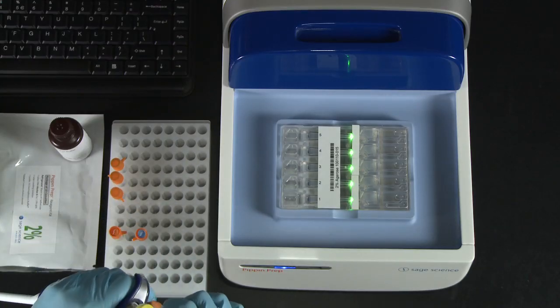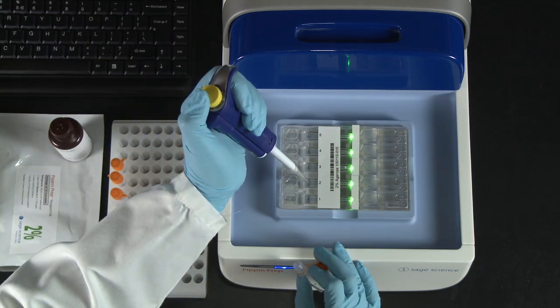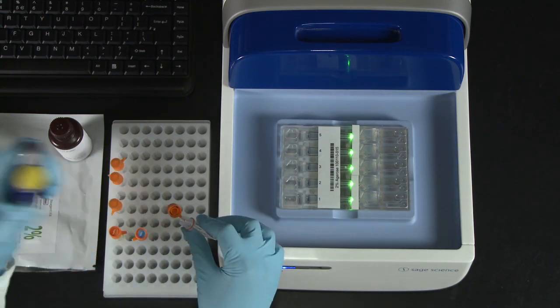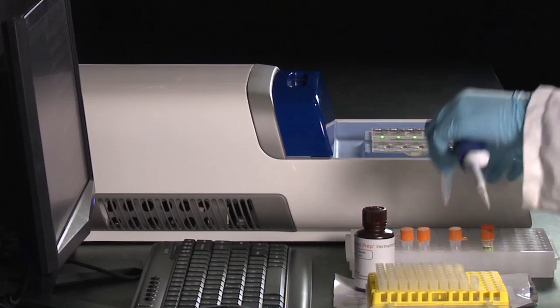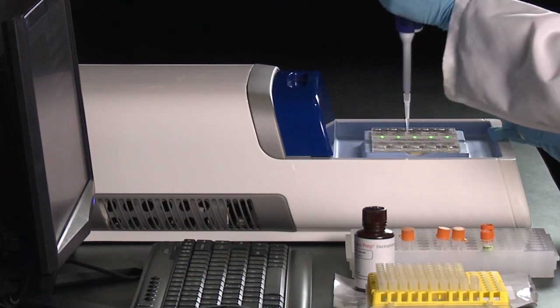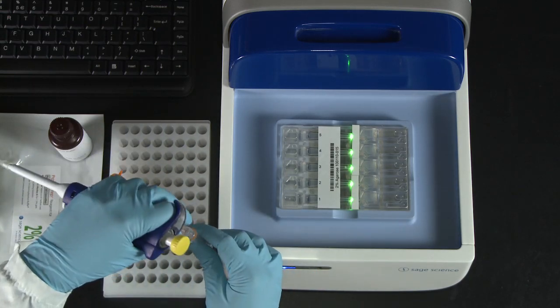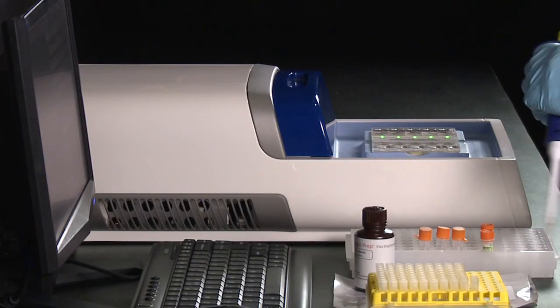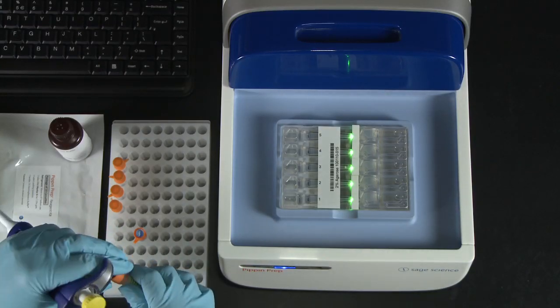Next, pipette in 40 microliters of your samples into the four sample wells. Then pipette in 40 microliters of reference ladder into the reference lane.